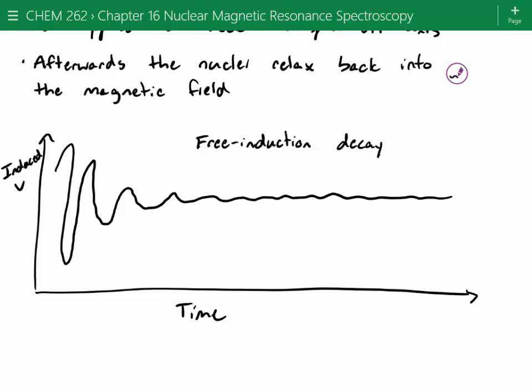So just like any good scientist, when you get data that looks really complicated and messy, what do you do? You go ask a mathematician to make it look nicer. And so we can actually do Fourier transformations of this data to make it look much, much nicer. And we're going to cover what we can do to this in order to interpret it much more usefully.